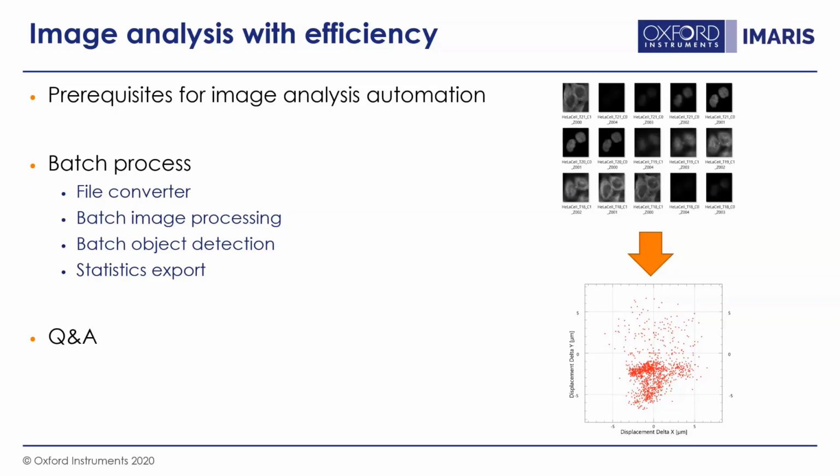Overall, our goal is to provide a user-friendly pipeline that takes the raw image from the microscope all the way to the final quantitative analysis that provides biological insights. We'll do a few demos in Imaris, especially highlighting new features such as the new Arena batch, new Vantage, and object classification.